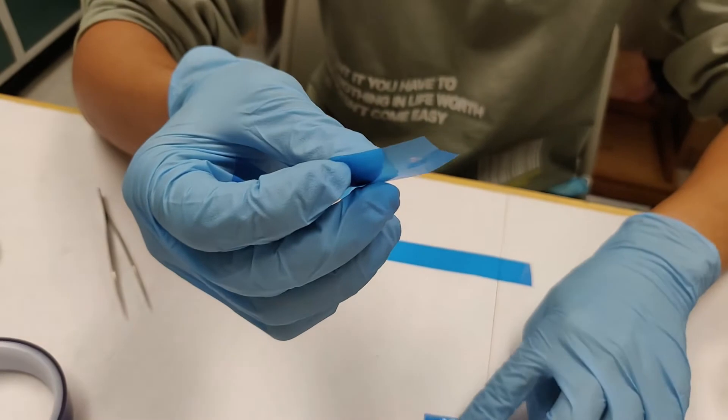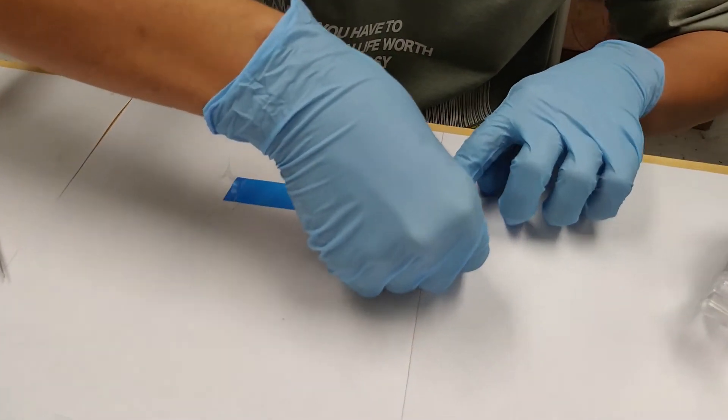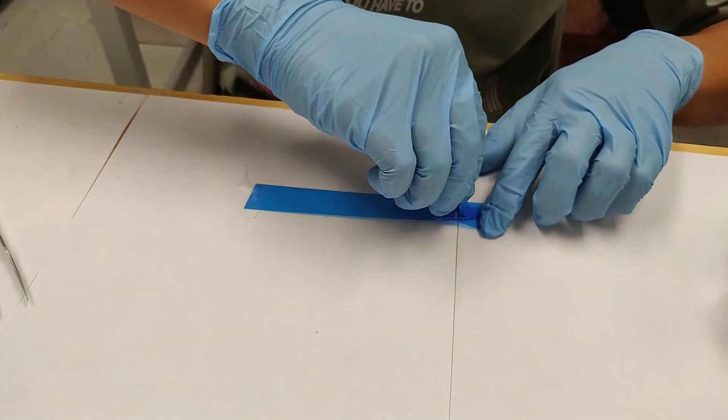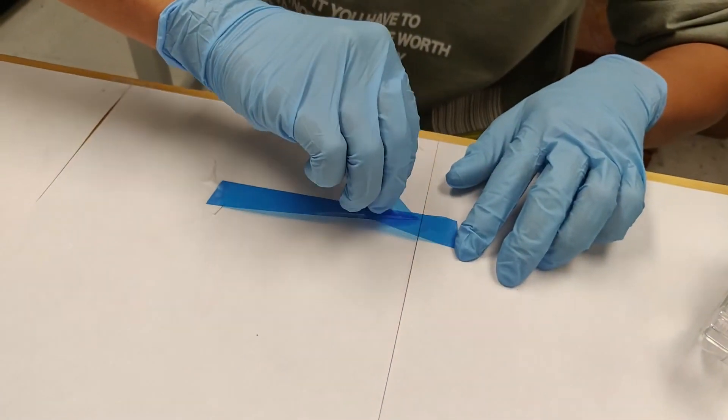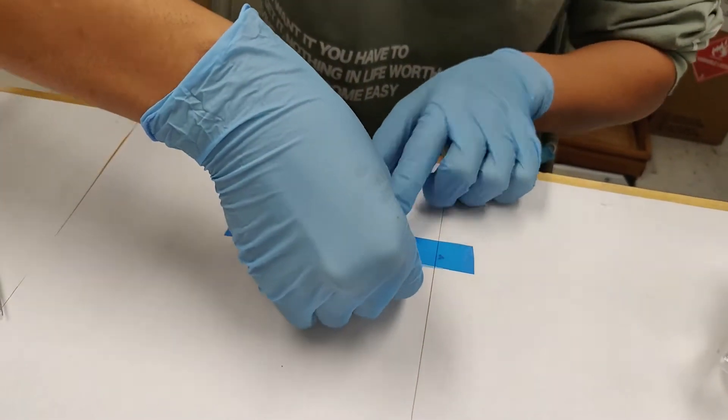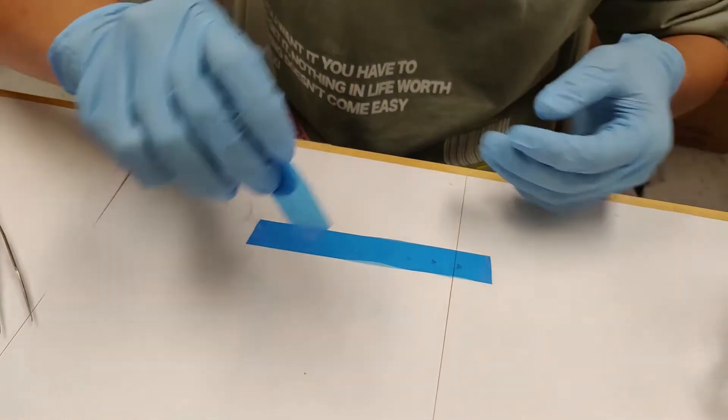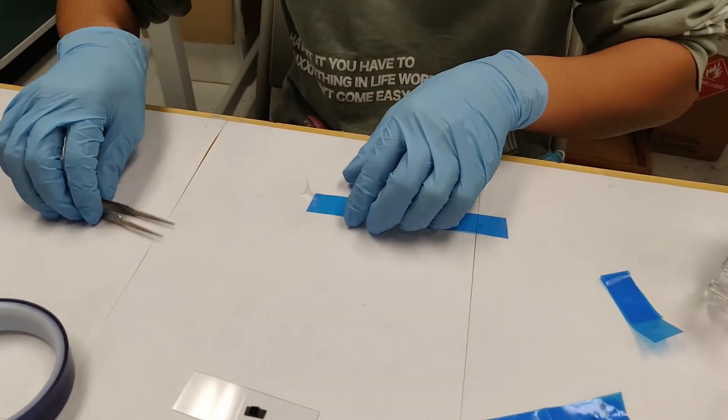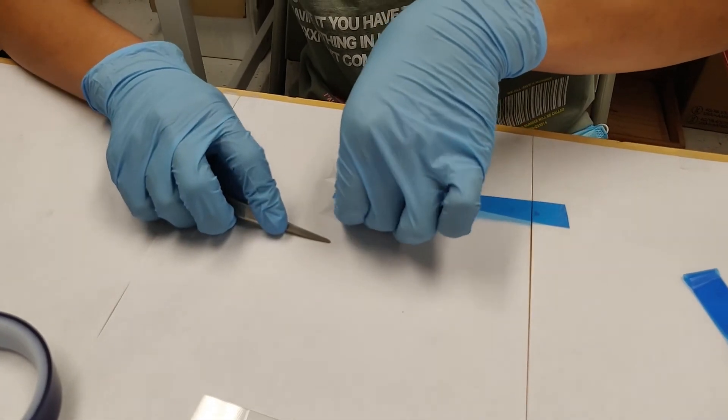So this is already thinned once. And now what you want to do is thin it again until it becomes very transparent. Alright, so right there is good enough. So you take this piece of tape, and this is the piece you'll be using to exfoliate onto the substrate.